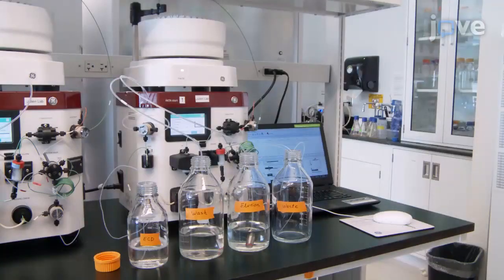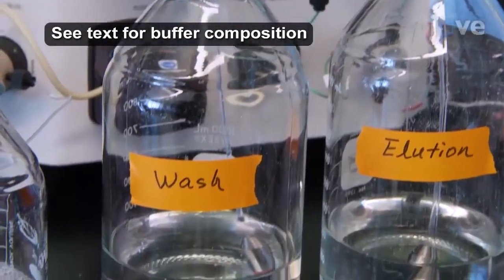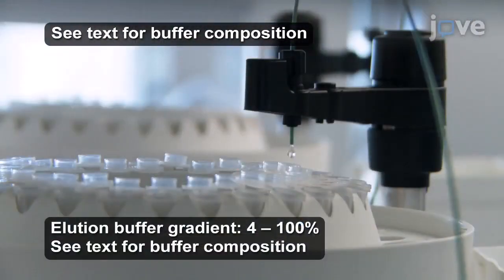Load the filtered supernatant at 4 milliliters per minute onto a nickel NTA column in a benchtop chromatography system. After this, wash the column with 3 to 4 volumes of wash buffer. Elute the purified glycoprotein from the column using an elution buffer gradient while collecting fractions.